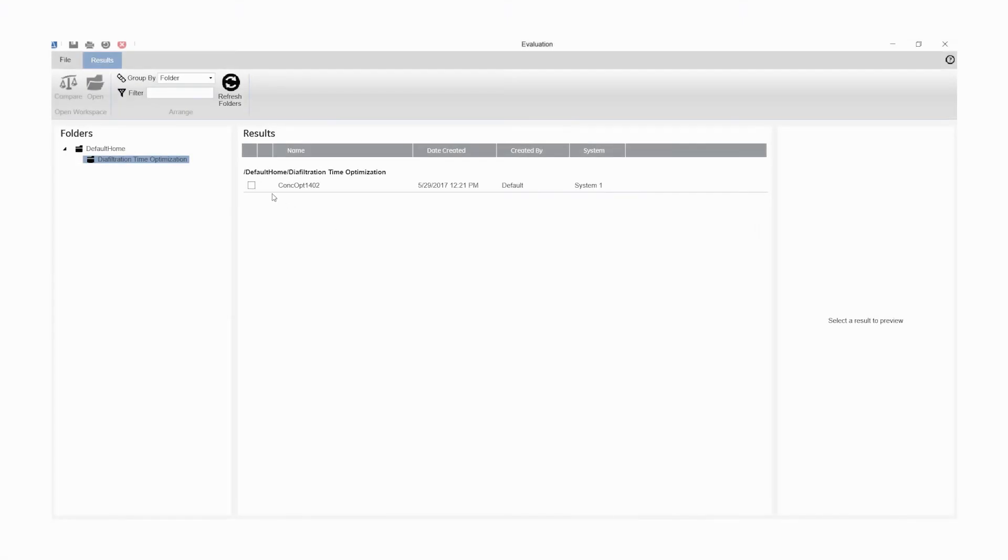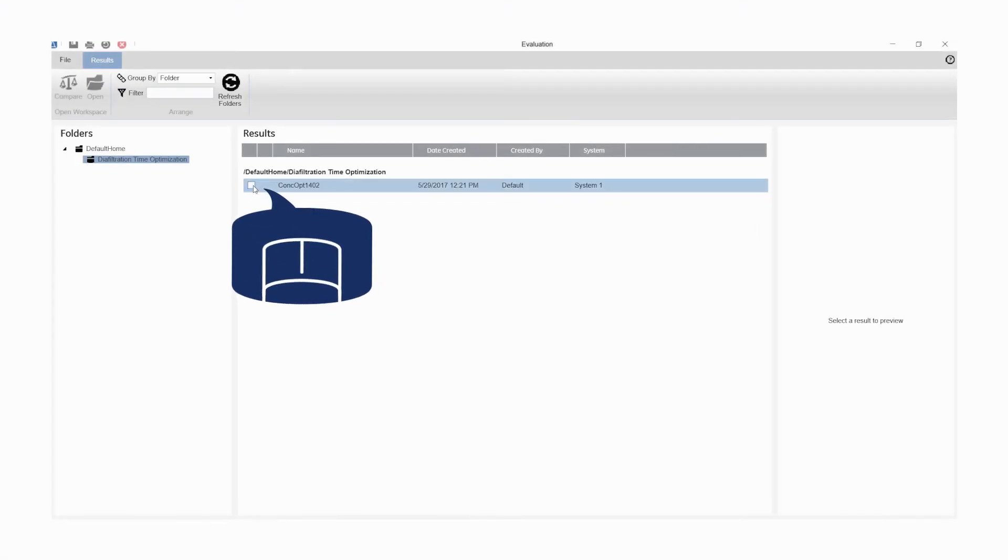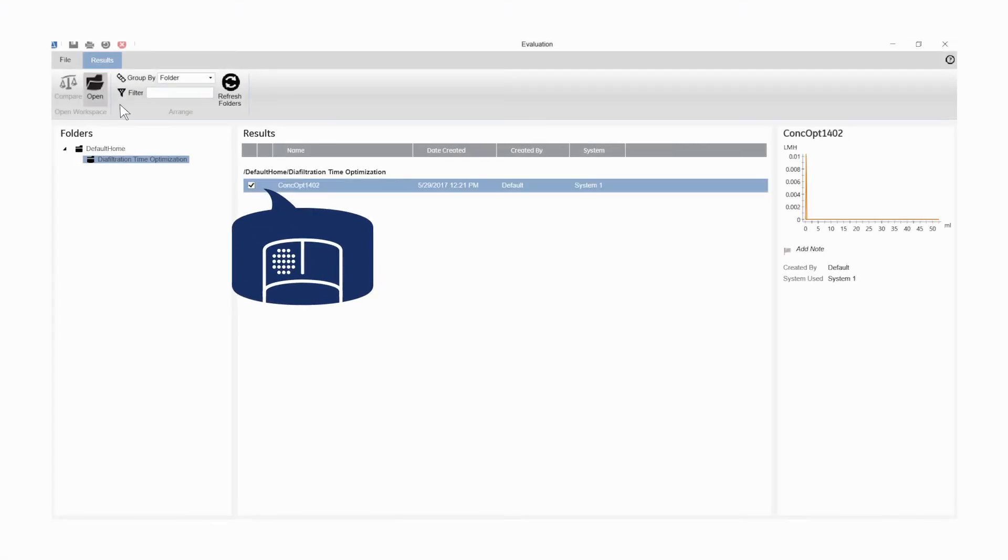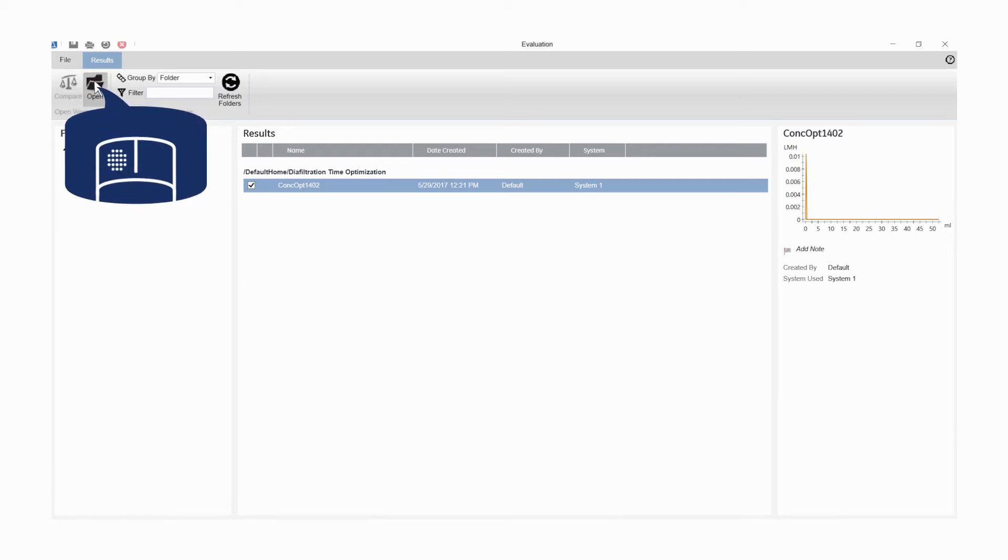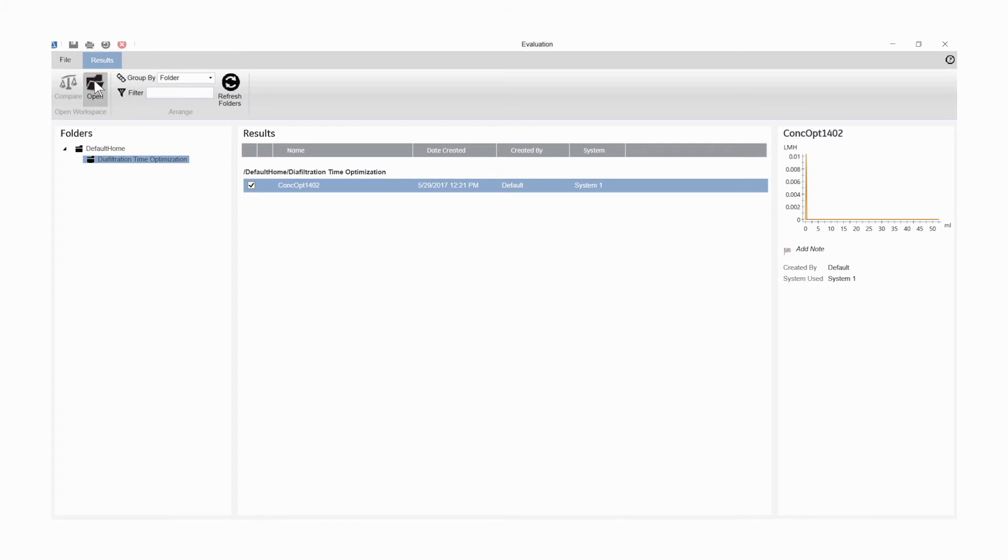Select the result you wish to analyze in the result browser. Click Open if a single result is selected or click Compare to compare the selected results. In this case, Open was clicked to select a single result.